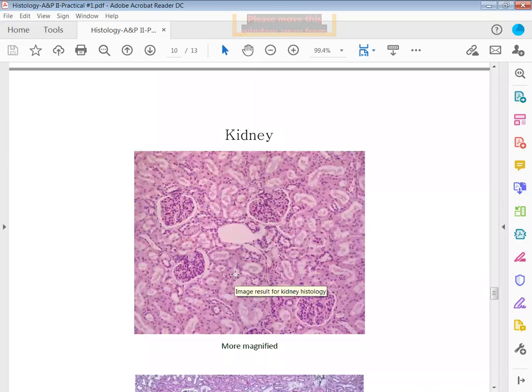This one is a kidney. And the first thing you can see here is it looks kind of similar to the pancreas. The difference here is in the kidney, instead of having blobs of light cells, you're going to have these circular blobs of darker cells. And all these are going to be surrounded by this C-shaped void area, okay? So these little balls of cells are almost shaped like a kidney bean. The dark cells in the middle, and then this light void around it, give a kidney bean shape. So that's going to clue you into this is a kidney.